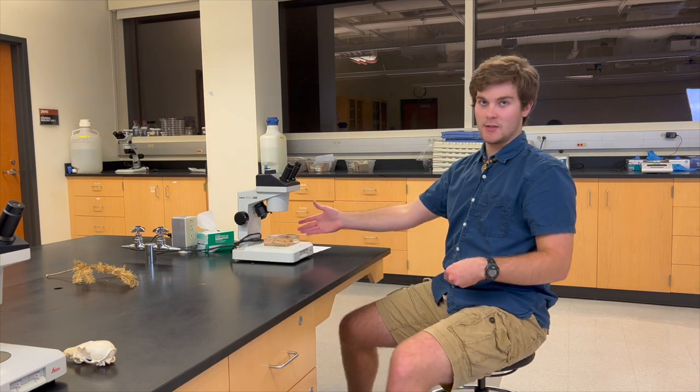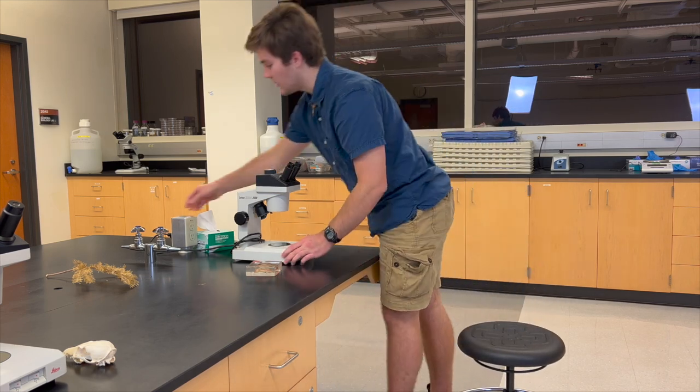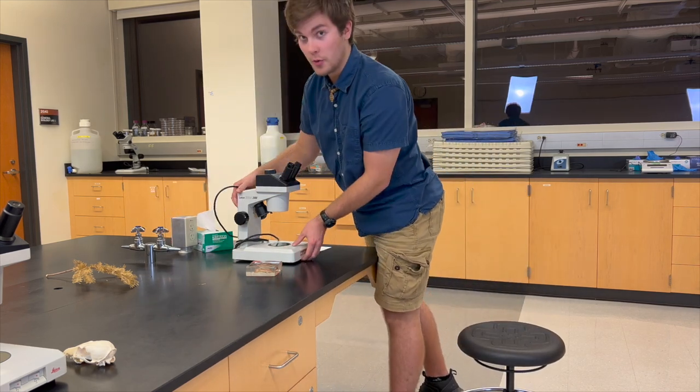So that's the dissecting scope. Once you're done, you move the specimen off, return it when you're done with it, and unplug the dissecting scope and return it to wherever you retrieved it from.